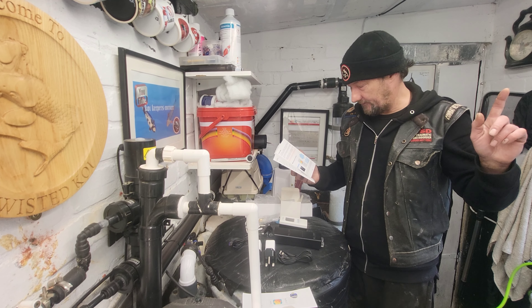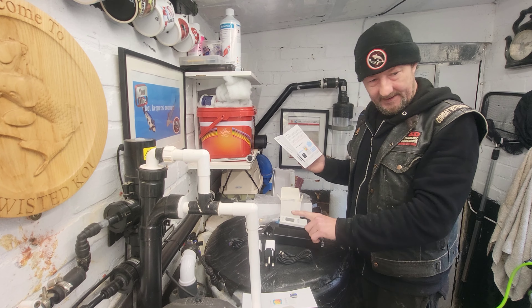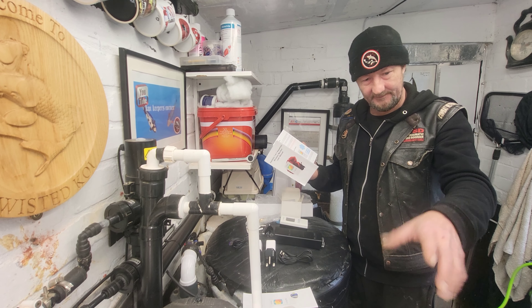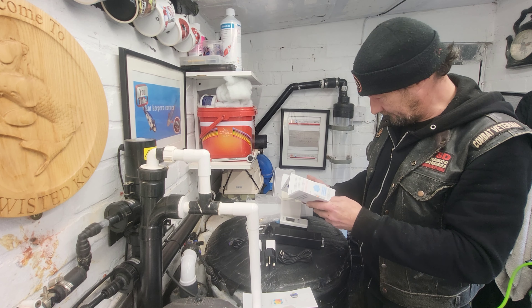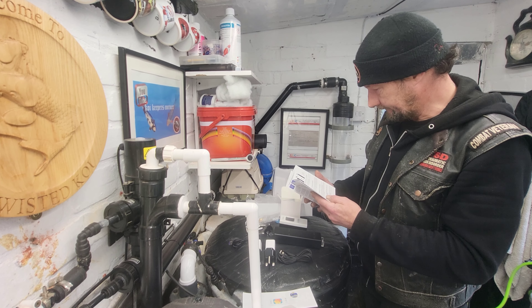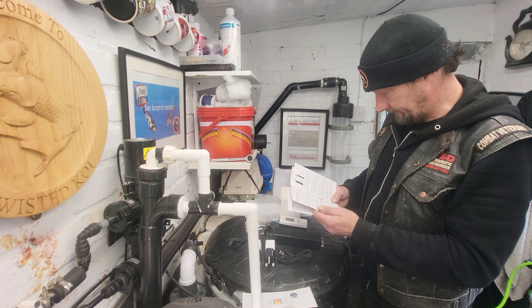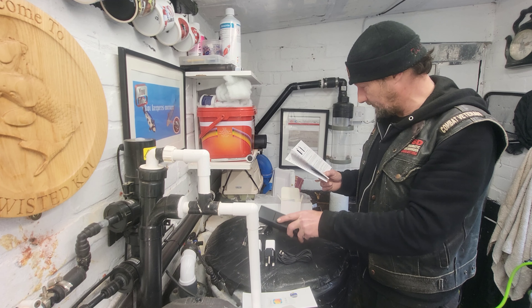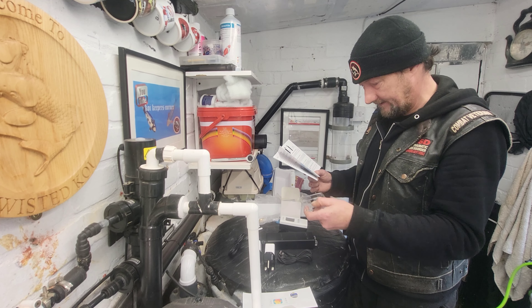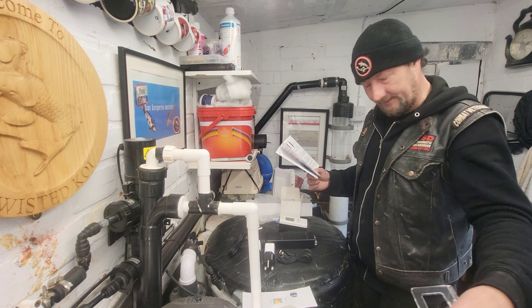I should be able to set the display unit on that wall, which will give me the best chance of picking up the Wi-Fi in the house. Then the probe will go on the outside - or inside the water - on this side. There are two methods to fix the probe: you've got the suckers, or you've got this bracket. I might end up screwing that bracket into the wall.